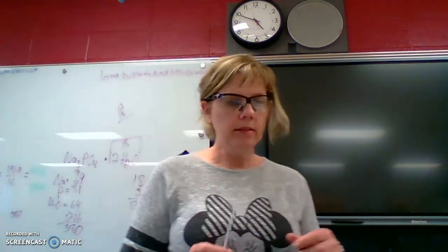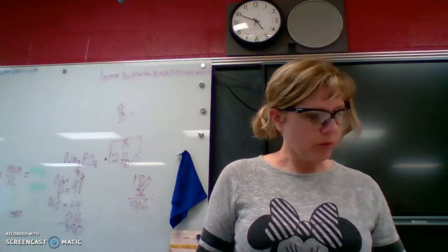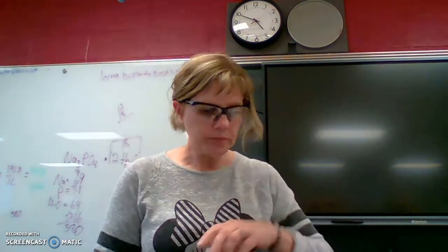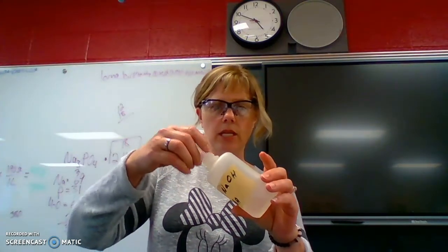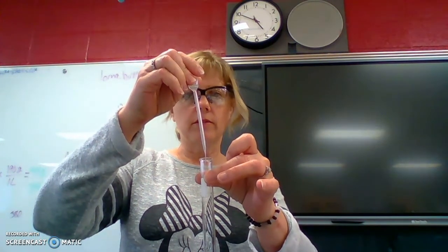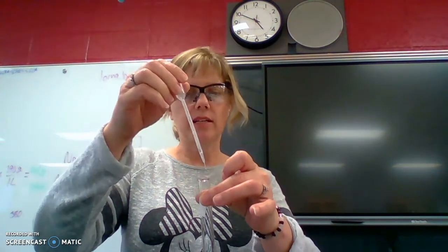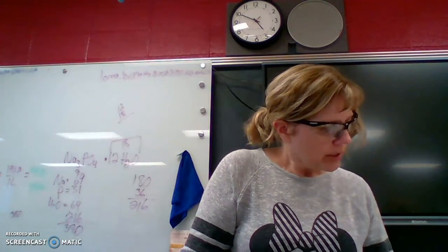All right, so a clean borosilicate glass test tube, 20 drops of sodium hydroxide. So I have 1 molar sodium hydroxide. Need 20 drops of that. It's a clear solution, which doesn't make it extra cool. It just is. That's my observation. I'm counting super fast because it's not that exciting to watch me count my drops. So that's my 20 drops of sodium hydroxide.